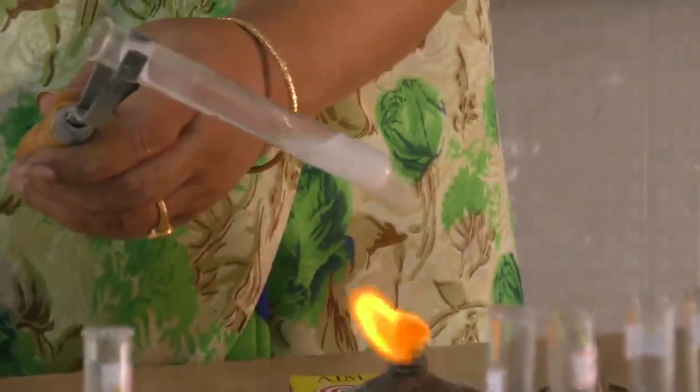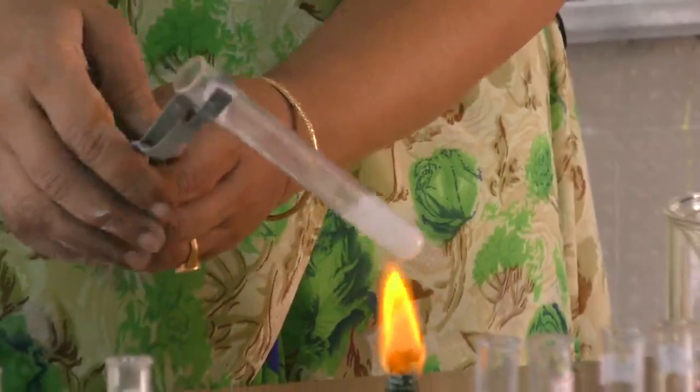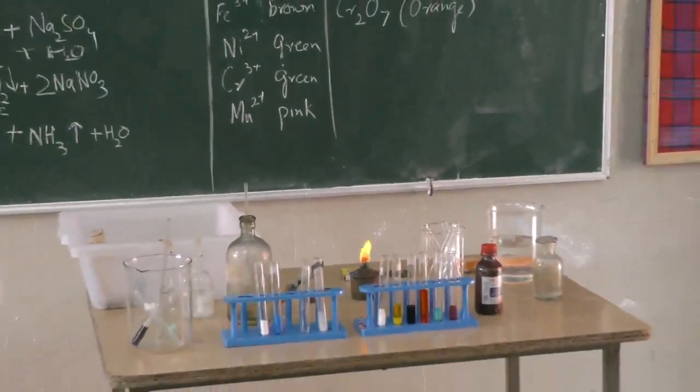So it gives dense white fumes with this. Give me a paper. And Nessler's reagent I'll try to show you in this.